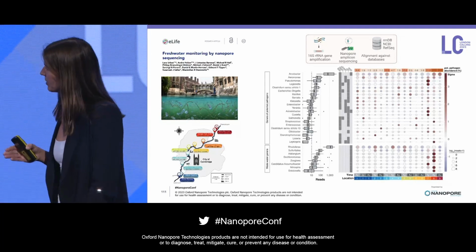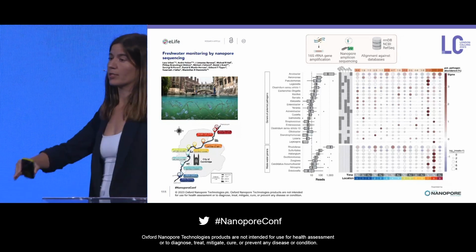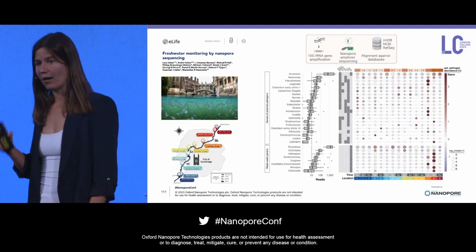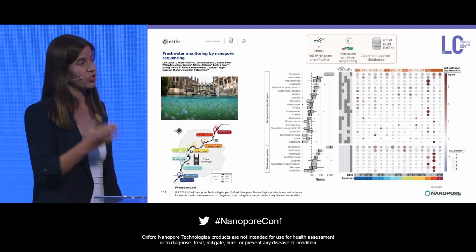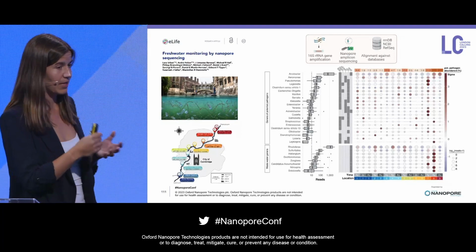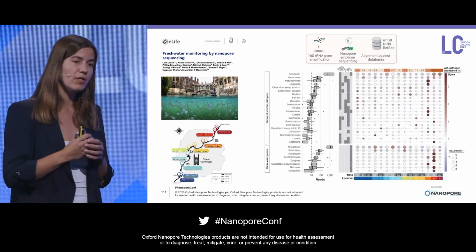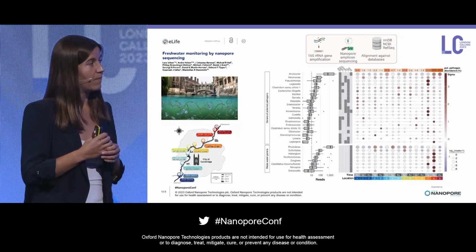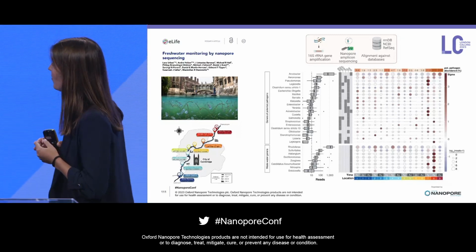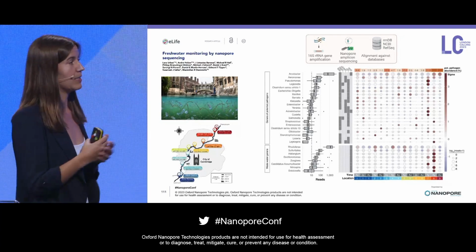Now, the important part is on the right side here, where you again see at the bottom all the sampling sites, so basically along this gradient of anthropogenic impact. And the color coding shows you how enriched certain bacterial genera are in any of these sites. I hope you can appreciate that at sample 7 that I just pointed out, this hugely anthropogenically impacted location, we find an enrichment of potential human pathogens. Whereas at site 8, which was really the output of this sewage pipe, we find an enrichment of wastewater-associated bacteria, which makes a lot of sense, that we are finding the signature there.